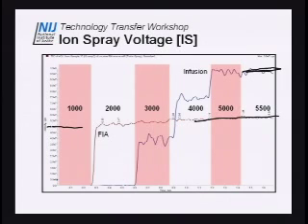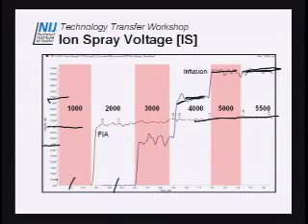Or I'm sorry, it's down here. 3.5 e to the 7, and then about basically double that by the time I go to 4,000 here. And then I add a lot more when I go to about 5,000. Not much difference between 5,000 and 5,500. At that point, you're not really gaining a lot by going the little extra mile, but 5,500 is where we run it. But you can see the huge difference between 1,000 and 2,000 and 5,500.